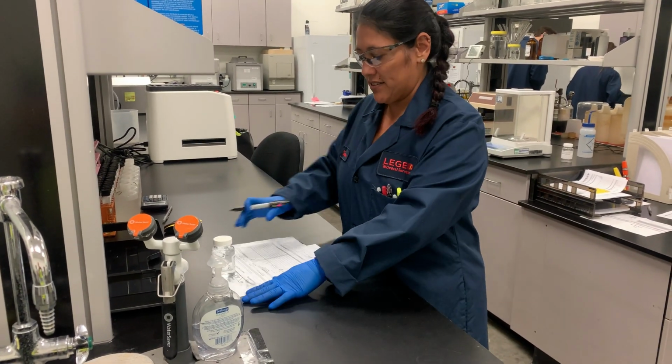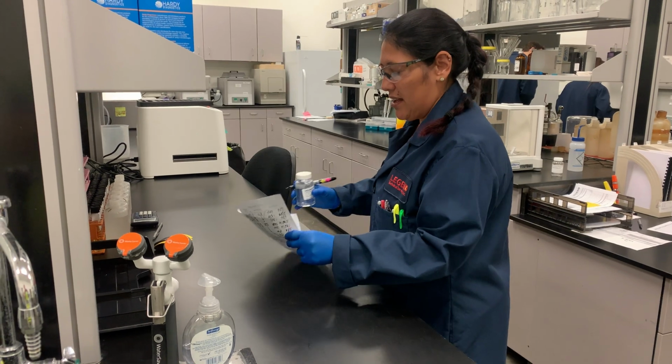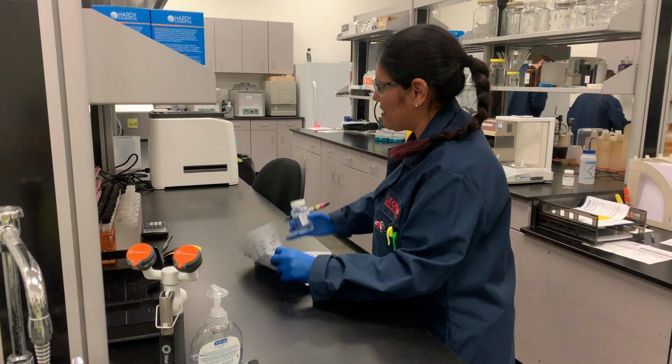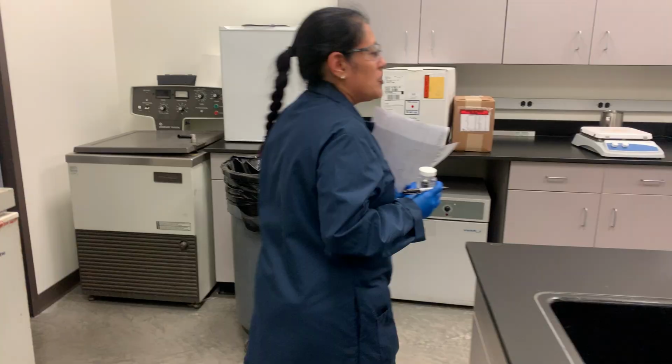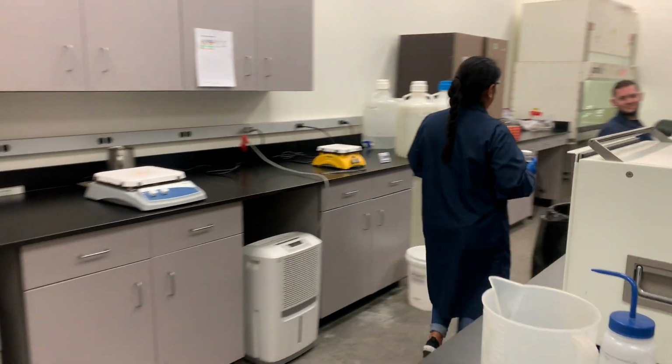So first we just want to check the sample and then verify the times. And then once we've done that, we'll have someone do a second check to verify what the first person has done. Josh, could you please do a second check?